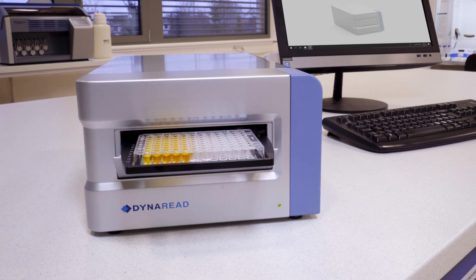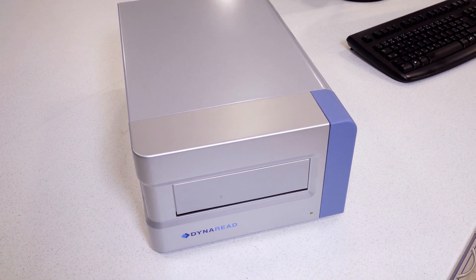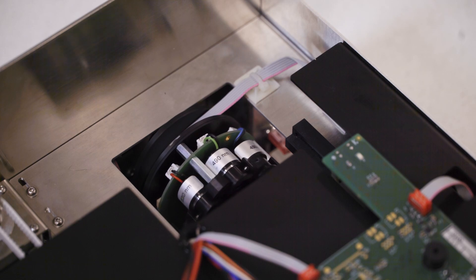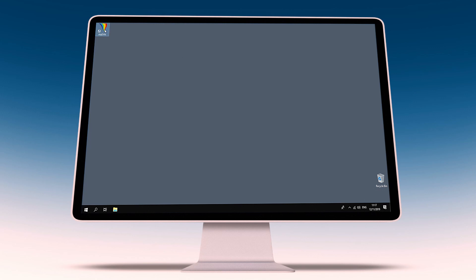With DynaRead, you get a superior solution for your absorbance-based assays. The state-of-the-art optics provides not only long-term stability and reliability, but also speed and wavelength selection abundance. The reader comes with AlaDYN software, making it a powerful yet user-friendly analytical tool.